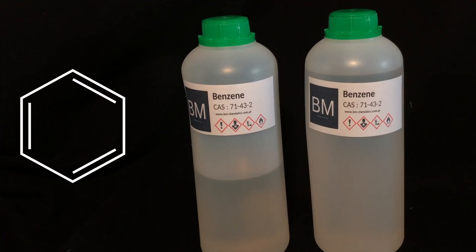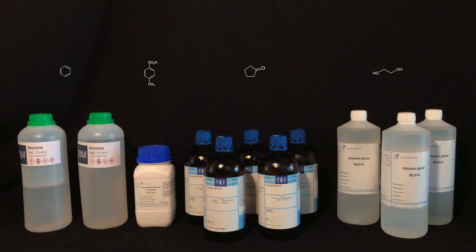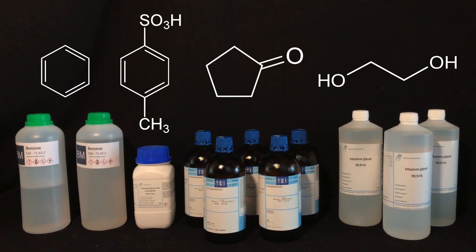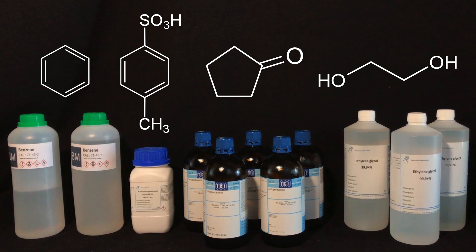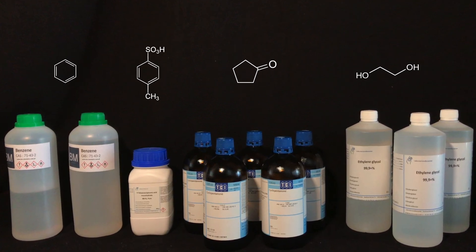You could use toluene, but benzene has a lower boiling point which may increase the yield. And there you go, we're now ready to begin with the first step of making cubane monocarboxylic acid. These are the chemicals with their molecular structure.